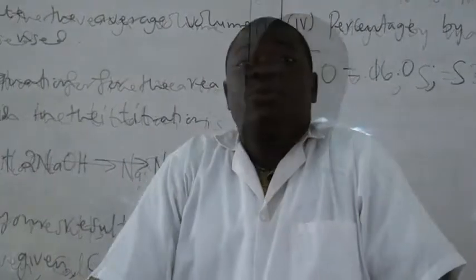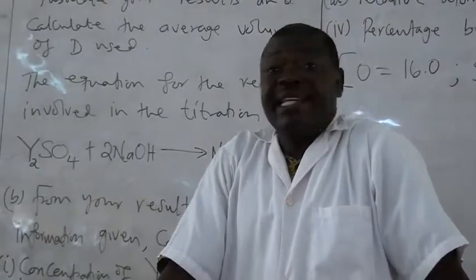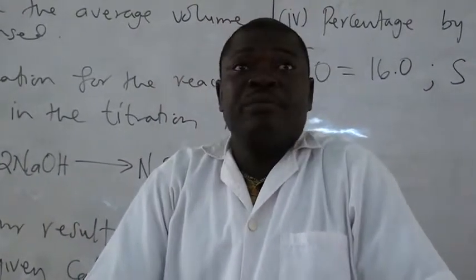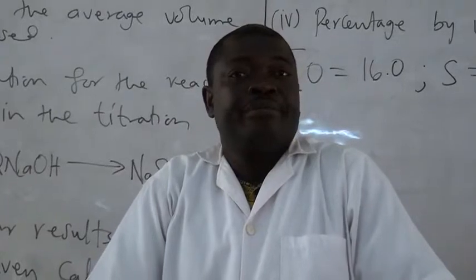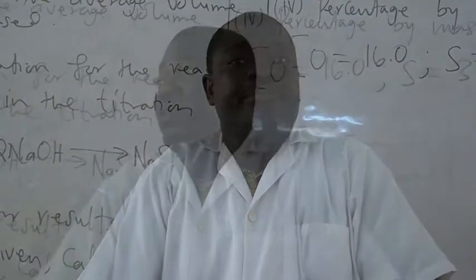Containing the Y2SO4, and solution E is the one containing 0.025 mole sodium hydroxide in 250 cm cube of solution. What's the solution?